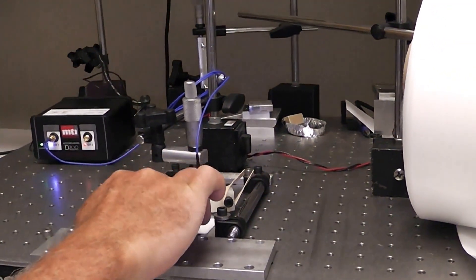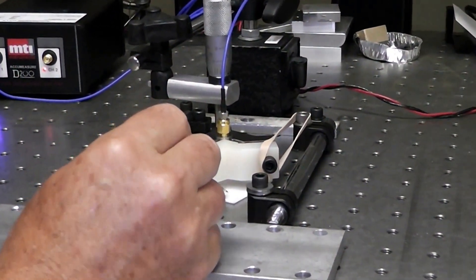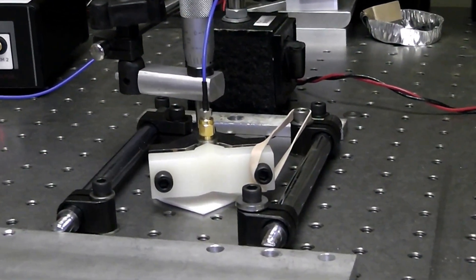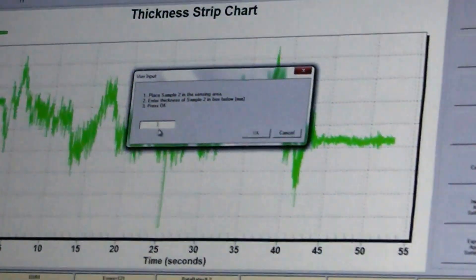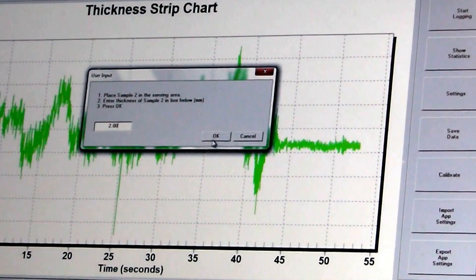And the next thing I'm going to do is put this sample of known thickness in here, slide it under the probe. I'm going to tell the system that the sample is 2 millimeters thick. Click OK.